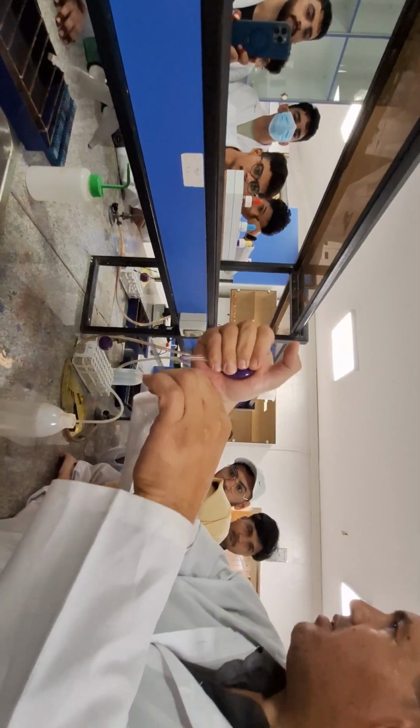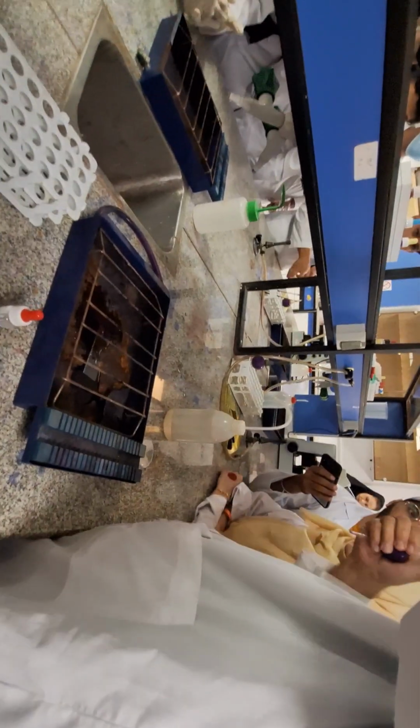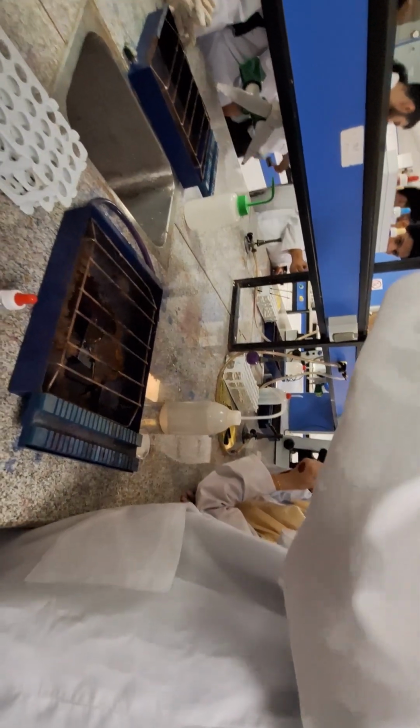The final step is safranin. The time of safranin is 30 seconds to 1 minute. The final step is washing and drying. Look here. Washing and drying. Don't use a pour for smear drying. You understand? Bismillah.